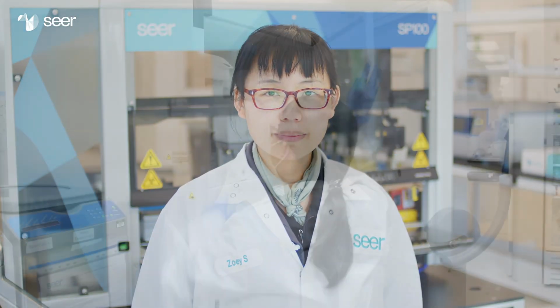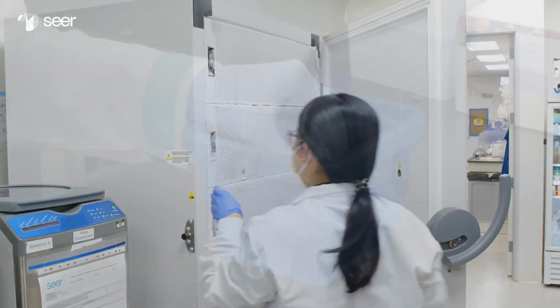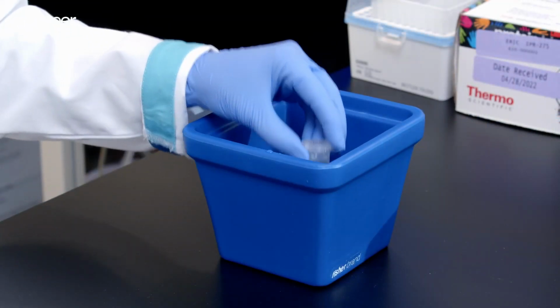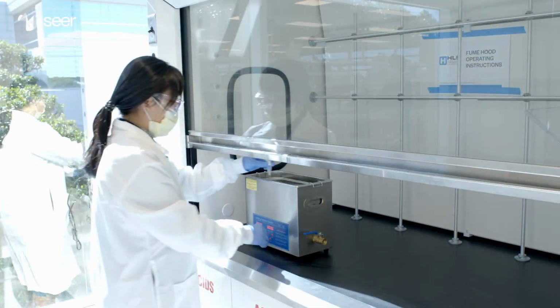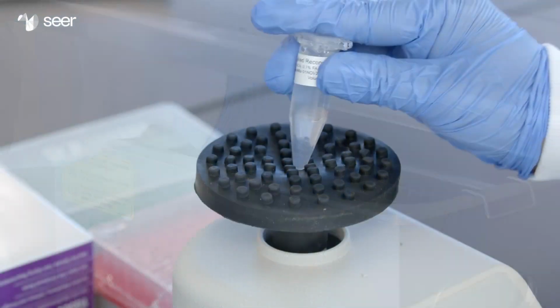Now we'll prepare the peptide reconstitution buffer. Remove the peptide reconstitution buffer from -80°C storage and thaw in a room temperature water bath. If needed, sonicate for approximately 10 seconds in a room temperature water bath. Vortex briefly.